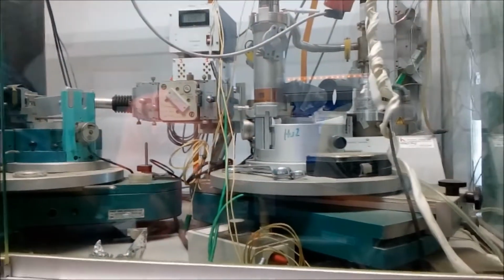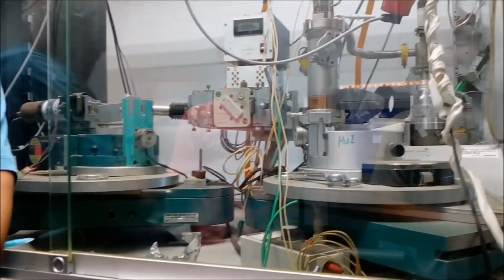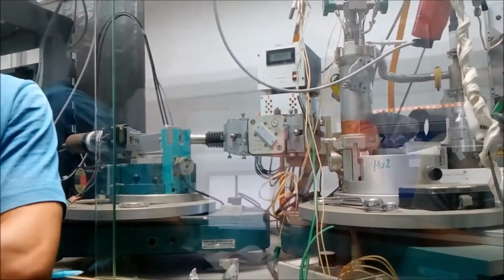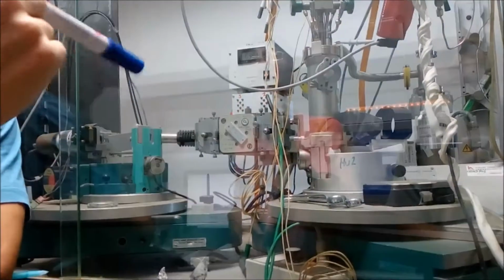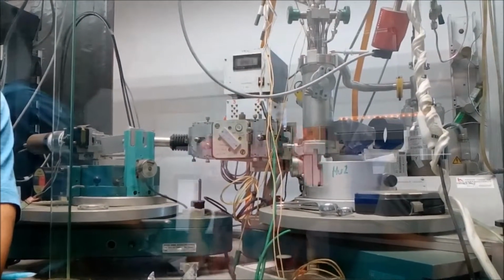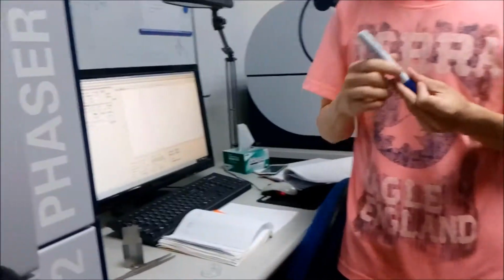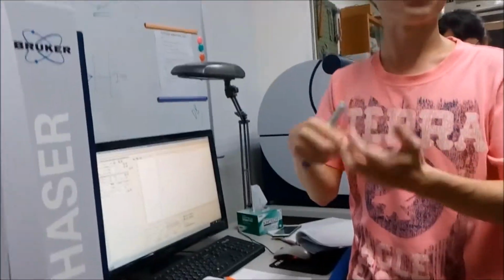It can work at different temperatures, but it's broken now. I remember it could test up to 400 degrees. You heat the sample to 400 or 500 degrees and see the difference in the crystal phase, because at high temperature the crystalline structure will change.